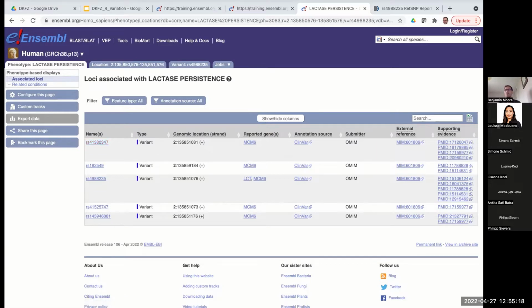So the variant that you've described here is what we call HGVS format. This is a variant notation format that we don't support for searching from the main Ensembl website. However, you can find variants in HGVS format using the variant effect predictor.